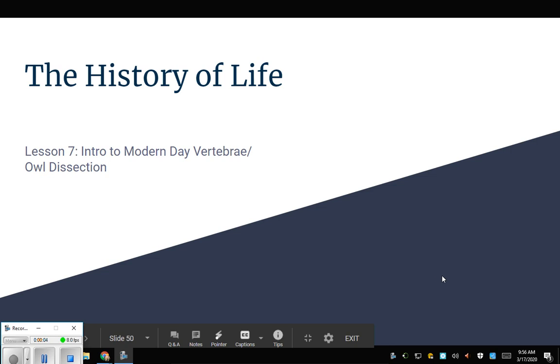Today we're going to be talking about the modern day vertebrates and our owl dissection. Unfortunately, I'm sad that we can't do this together, but if we were together, we'd be doing an owl dissection. Through this, we are going to be watching a video of me dissecting an owl and looking at some of the things that are presented in the owl pellet.